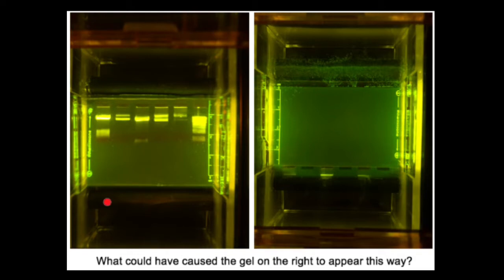The gel on the left is normal. On the right you see, or we don't see any bands here. So something is wrong with this gel.